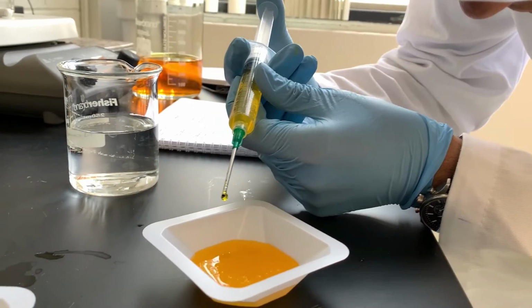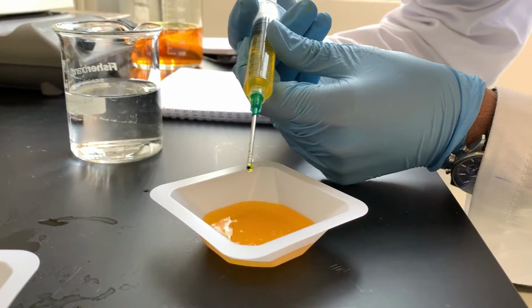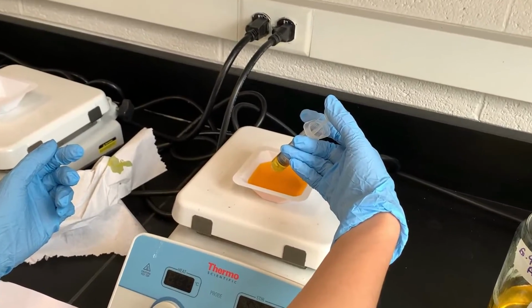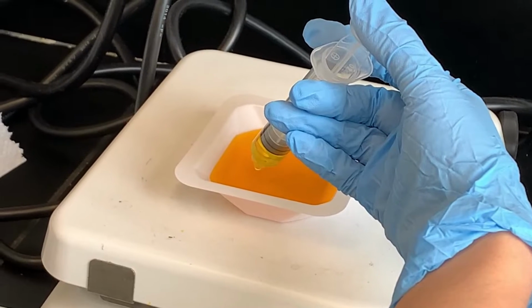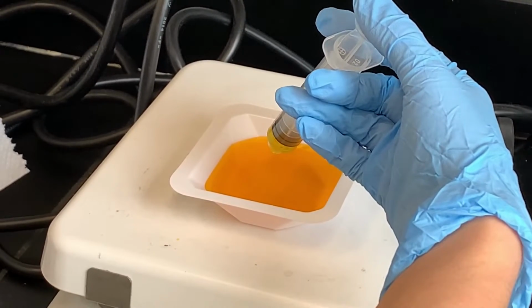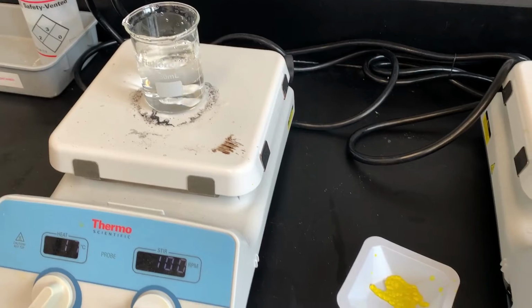To make the beads, we first poured some calcium chloride solution into a weigh boat. Then we loaded some alginate solution into a disposable syringe and slowly dispensed it into the weigh boat. As shown here, we counted the number of drops to control the amount of beads we have. After the beads are formed, we poured the remaining solution into a waste beaker with a filter paper on top to capture the beads. The beads are then rinsed with DI water and transferred into a clean weigh boat.